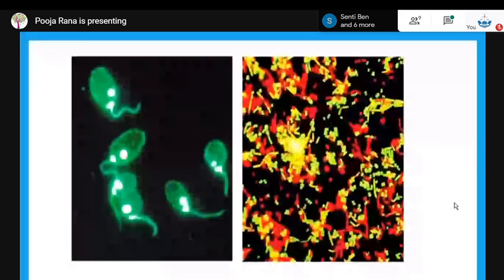Magnification of comparison microscope. Yes, it is asked. You asked about hair and the stereo microscope. It can be visualized using the stereo microscope. The outer structure would be visualized using the stereo microscope, whereas you can also use the compound light microscope to visualize the hair sample.